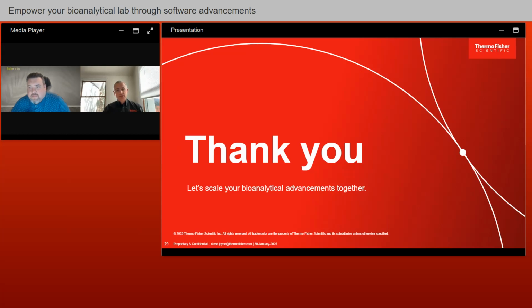But also we cope with the fact that you don't always get to specify which label you're going to use. So Watson also has a capability around being able to use external barcodes and map them to the internal barcodes that you might want to stick on the samples yourself. So we've got a digital method to reconcile between, maybe a third party's barcode and our own, and we have a full capability around how those barcodes can be generated within the Watson LIMS itself. Thanks for the question.